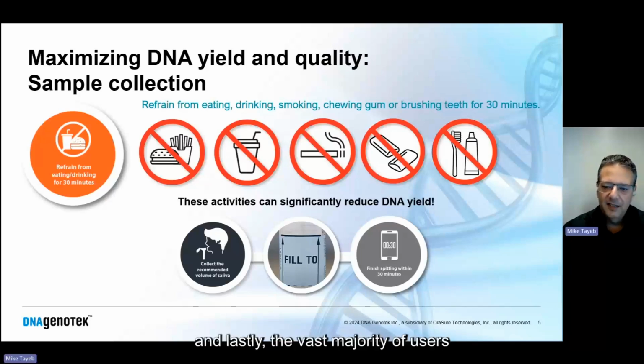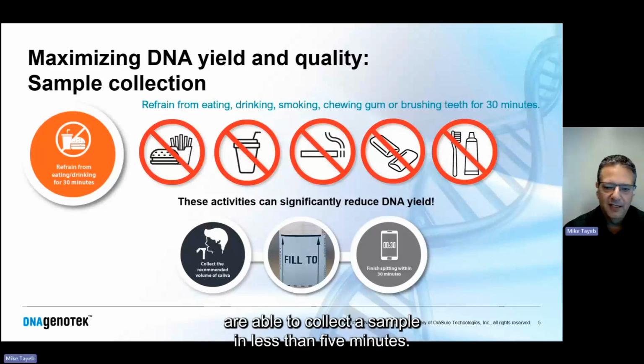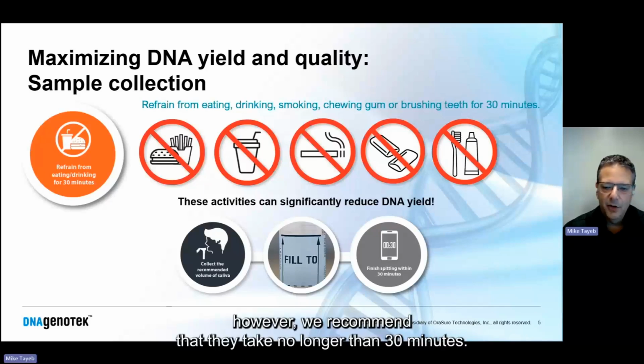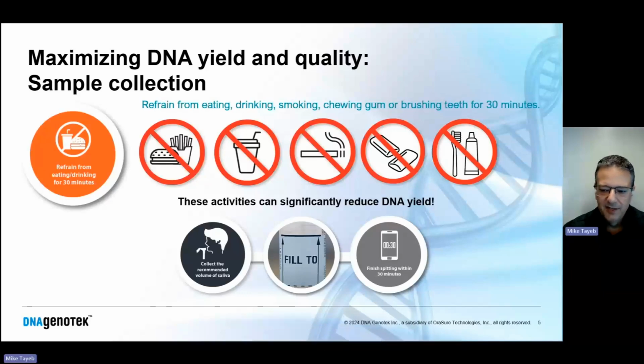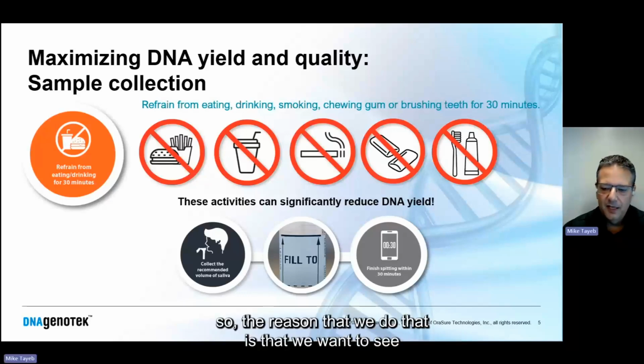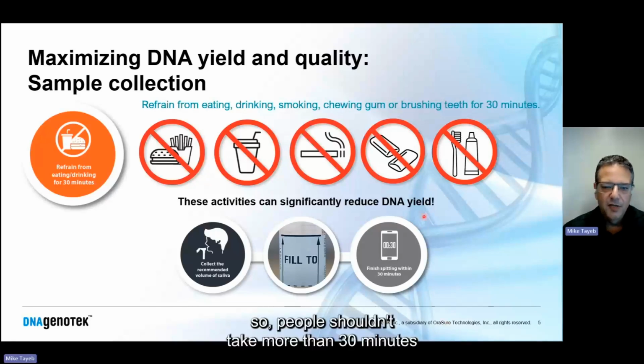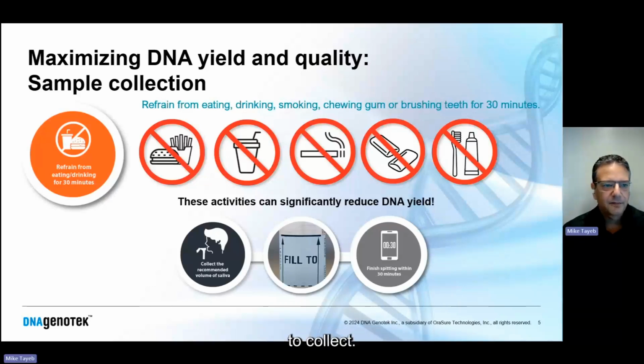And lastly, the vast majority of users are able to collect a sample in less than 5 minutes. However, we recommend that they take no longer than 30 minutes. The reason that we do that is that we want to see the stabilization solution added promptly to the sample. People shouldn't take more than 30 minutes to collect.